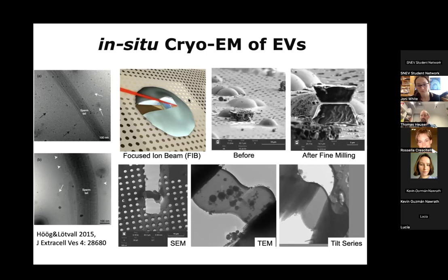And so I think right now in the EV field, I did a quick PubMed search before the meeting. I couldn't find anything if anyone has used cryo-FIBSEM to study EVs already. I think some people have just stumbled on EVs in their slices that they looked at, but I think it's not a standard method for EV visualization yet. But I could imagine, especially for projects that you just described, where you're interested in biogenesis or so, I think this is definitely a method to watch out for.